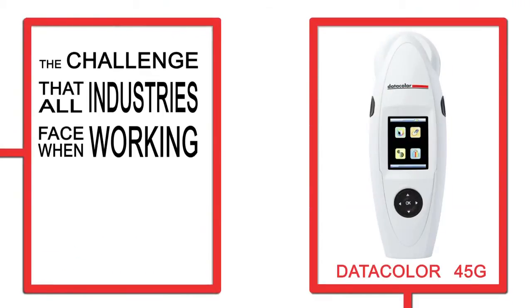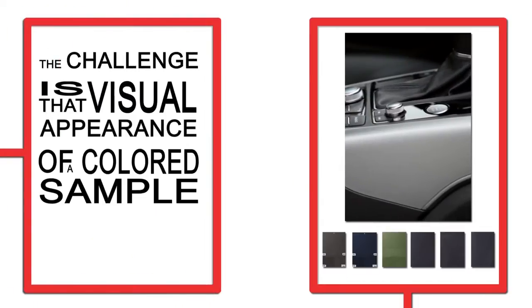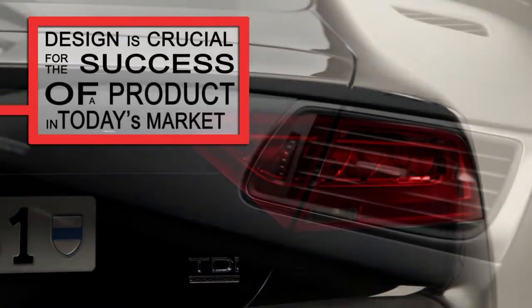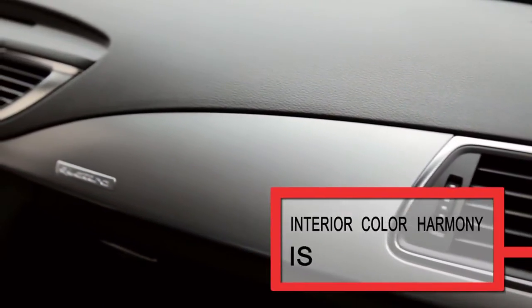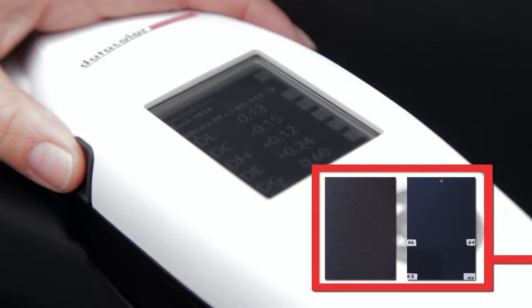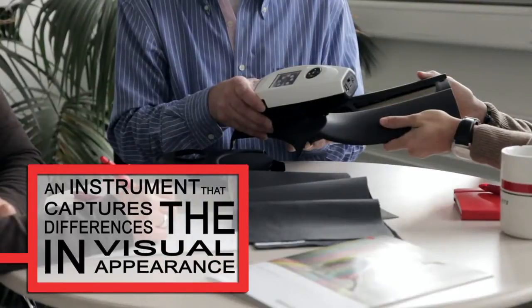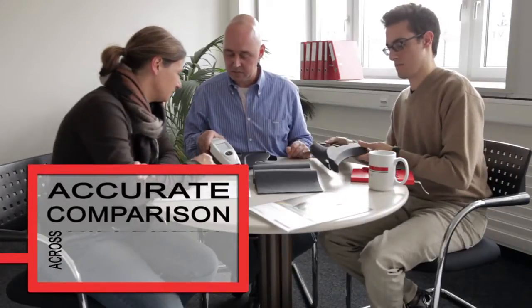The challenge that all industries face when working with colour in their production process is that the visual appearance of a coloured sample does not depend on colour alone, but also on gloss and texture. Design is crucial for the success of a product in today's market. Automobile manufacturers know that interior colour harmony is important in a customer's decision to buy a particular car. In multi-component products like automotive interior parts, it is essential to have an instrument that captures the differences in visual appearance regardless of whether they arise from base colour, gloss, or texture, to make an accurate comparison across different materials.